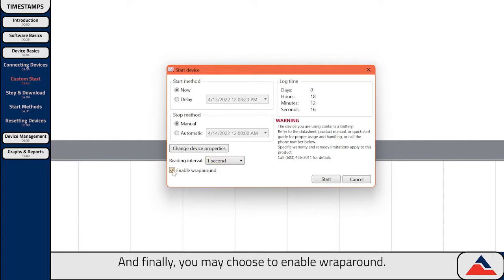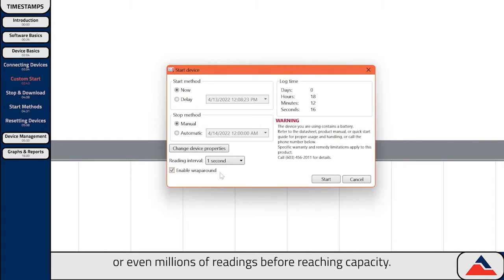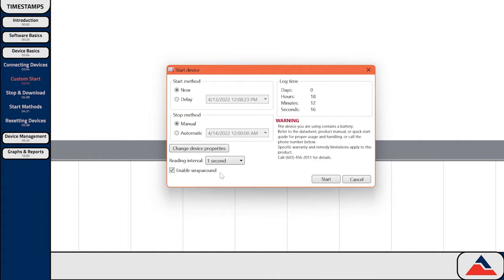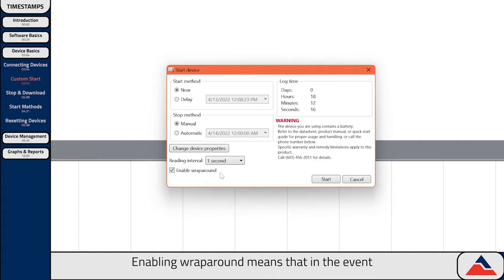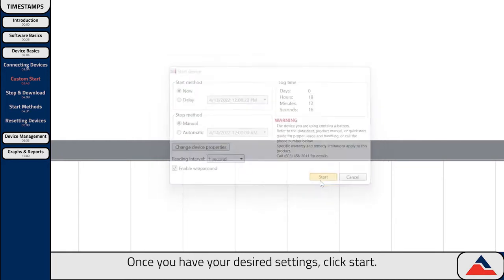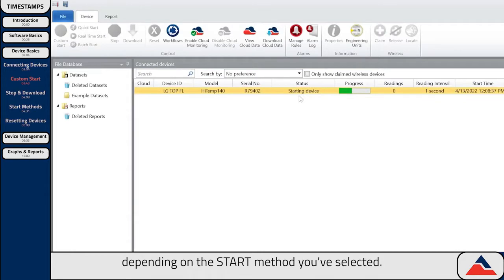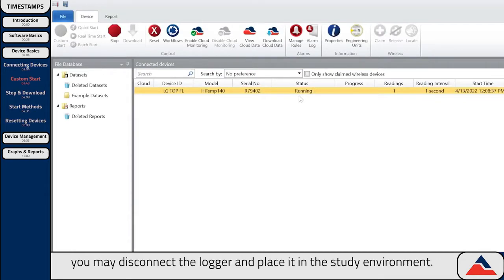You may also choose to enable Wrap Around. All of Magitek's data loggers have built-in memory for storing data, with some storing thousands or even millions of readings before reaching capacity. Enabling Wrap Around means that in the event the data logger runs out of storage, it will start recording over the oldest stored data rather than stopping. Once you have your desired settings, click Start. You'll then notice the device status will change to either Running or Waiting to Start, depending on the Start method you've selected. Once this is done, you may disconnect the logger and place it in the study environment.